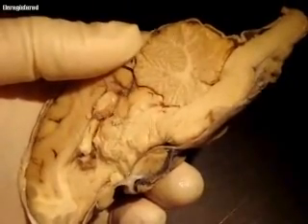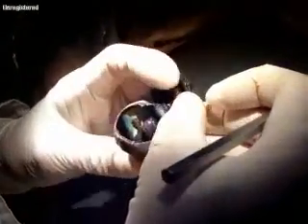Is that it? Ready for the eye? Where's the eye? Oh, here it is. Come on out. Since we only have 30 minutes left of class, or 20, have any of you gotten in to see Gladys besides the one group? Okay, looking at our eye.